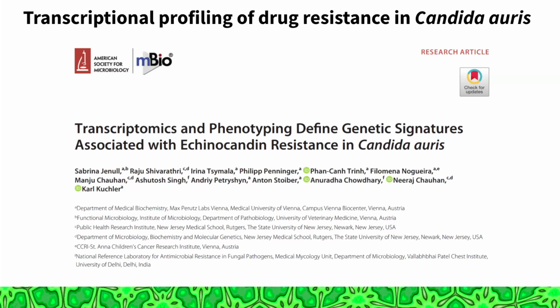And another area which I ignored completely at this point: BRC will also allow comparative analyses. This is when you want to compare two existing assemblies, or when you want to compare an existing assembly to something you would assemble yourself. This would progress in two stages. At the initial stage, because it's a hard problem, we would allow pairwise comparisons. So for example, you want to establish synteny between two genomes. And once this is done, we will expand to multiple genomes.